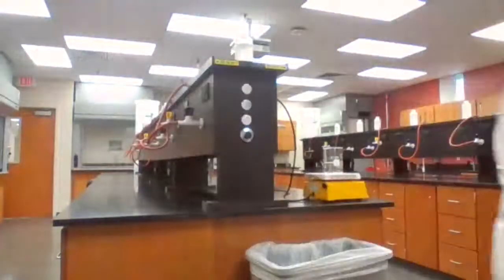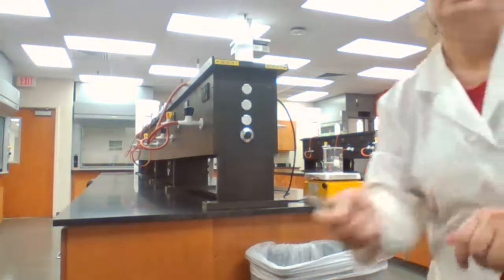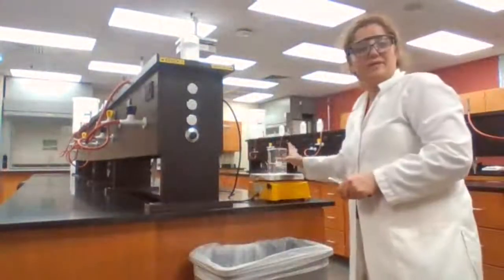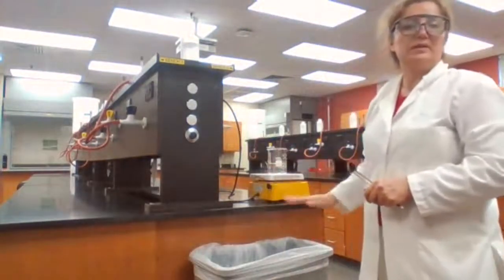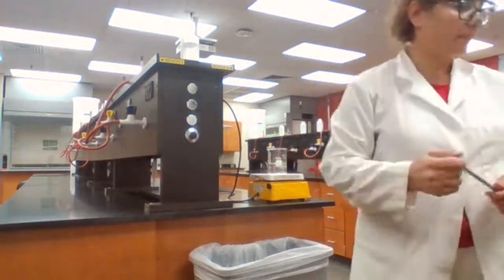What do I need next? I need to set up the hot water bath. I already did that. So I have the hot water bath here already prepared and it's going.